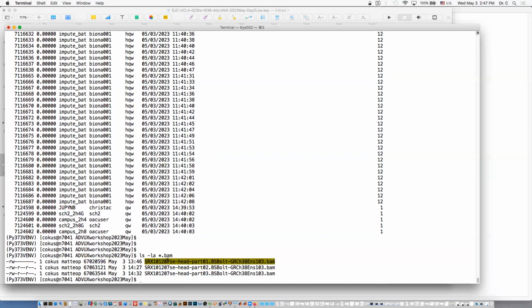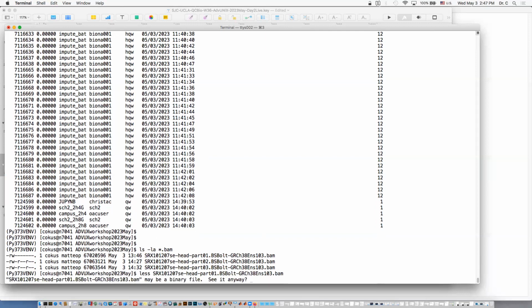If you're a bioinformatician, you're going to have to deal with BAM files sooner or later. If you've ever tried to look at them directly in less or something, they are a binary file, and less kind of knows it and says, "You're really sure you want me to show this thing?" You'll see that it's just binary data. When there's binary codes in here, like this bracket 8F bracket means there's a hexadecimal 8F, a single byte character that happens to not be printable. This is the way less shows you those.